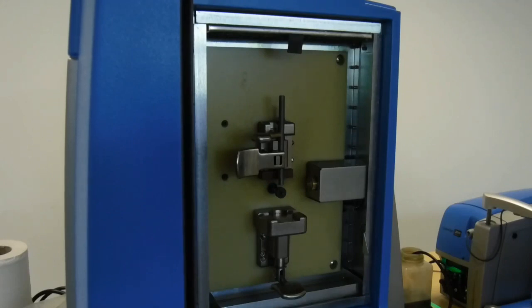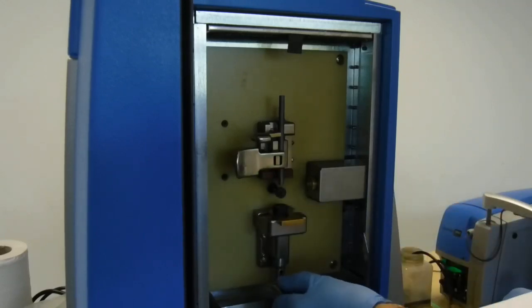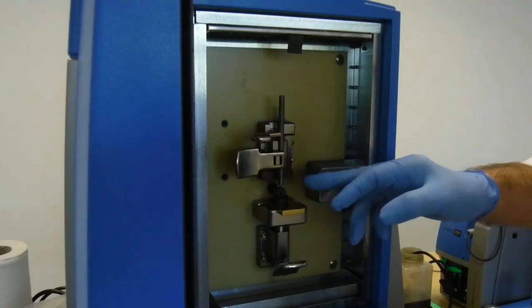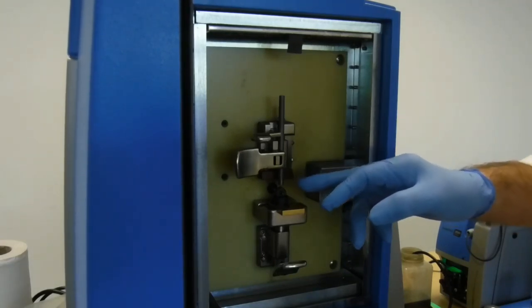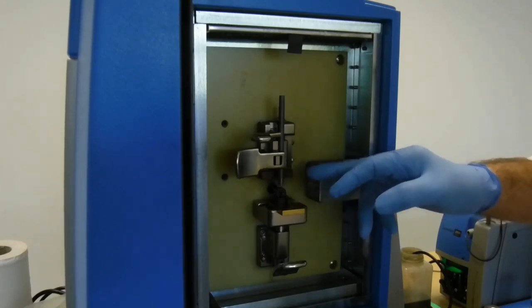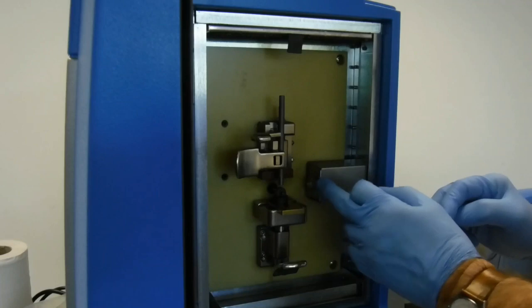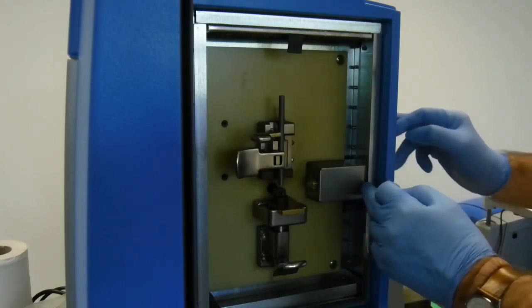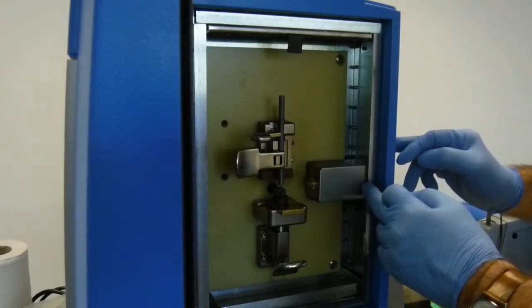The oil sample goes onto this little tray, goes in there, you lift that up, the cup now, the little graphite disc is sitting in the cup. When we start it going, that disc will rotate, picking up the oil, and the electric spark will happen. The light given off will be sent down this fibre optic through the window, into the optics of the machine, and you will get the analysis done that way.